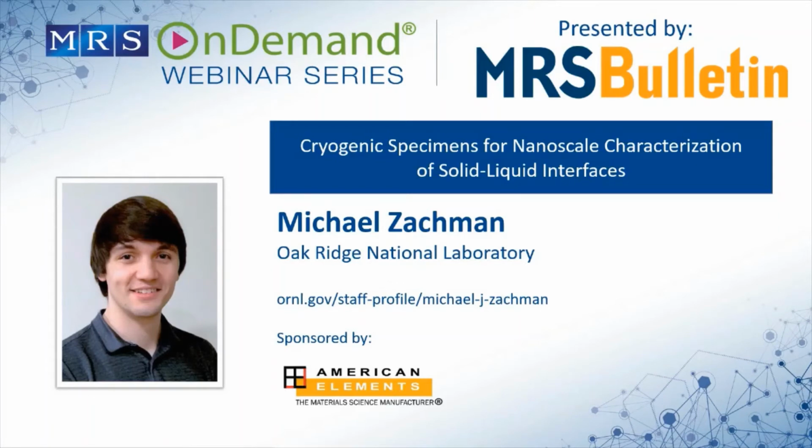You may have noticed on even some of my samples in the paper that there are small pieces of ice. This is because at different stages in the transfer or in the storage, you can end up with that sort of thing being introduced. Even if you do everything properly, there's still moisture in the air, and so you can end up with some possibility of getting ice on your sample. So first, I think things could be more user-friendly eventually, and that might help with this initial getting up to speed with everything, which takes quite a while.